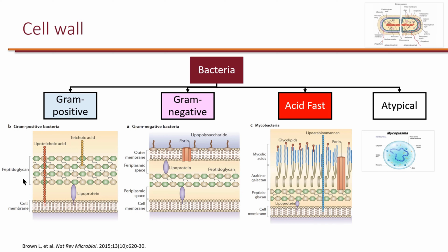And that's what we stain. So we stain the cell wall, and the cell wall is what gives the shape of the bacteria. So they will have different shapes. So, either rod shaped or spiral or other shapes that we will talk about shortly. And one stain that we can use is called the Gram stain. So Gram is the name of the person who came up with the technique.